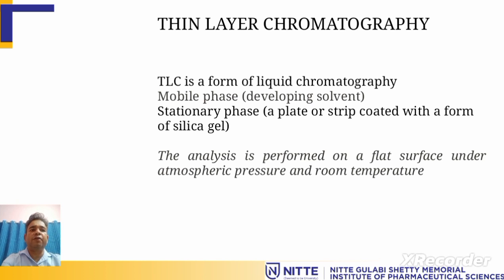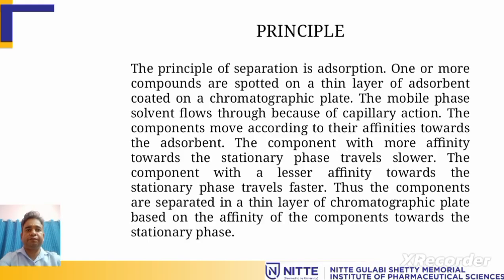That's called thin layer chromatography. So TLC is a form of liquid chromatography which has a mobile phase as a developing solvent and a stationary phase, a plate or a strip coated with a form of silica gel. The analysis is performed on a flat surface under atmospheric pressure and room temperature.